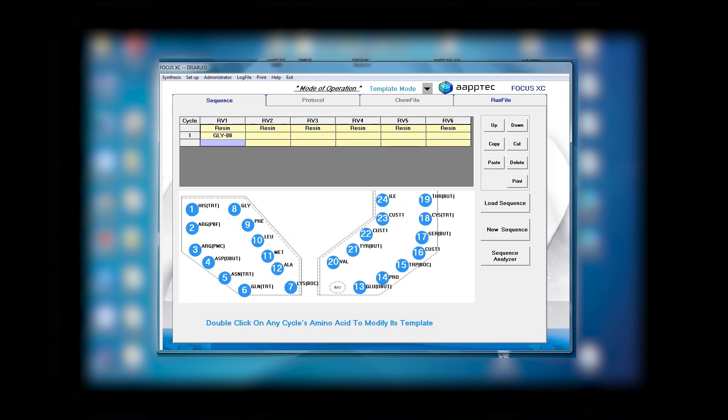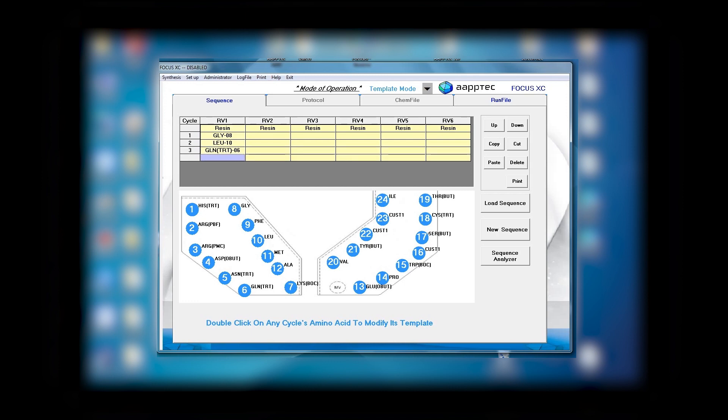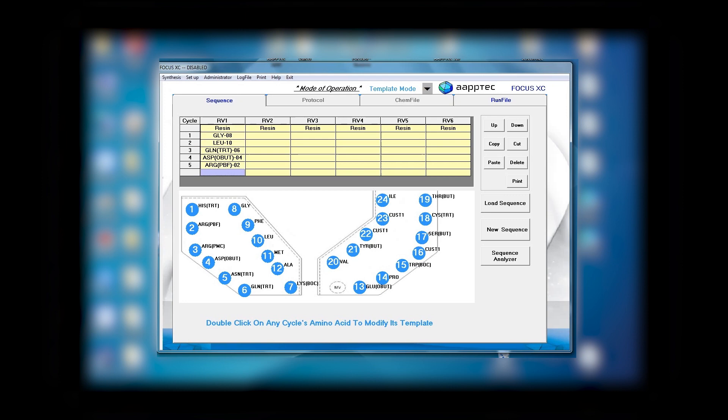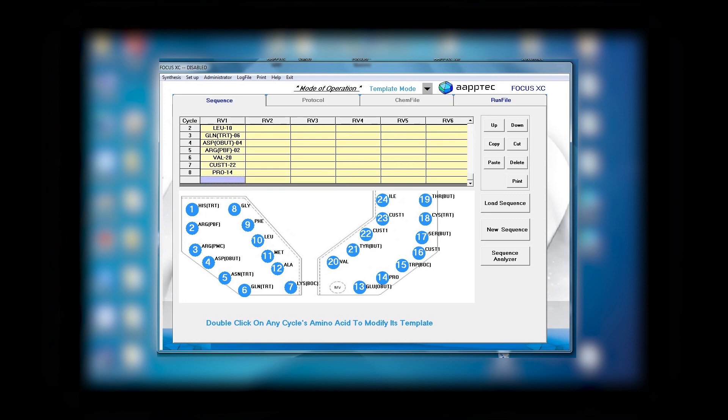The first thing I do is enter the sequence. For example, the first amino acid glycine, the second one is leucine, the third one is glutamine. I'll add aspartic acid and arginine, valine, tyrosine. You can select as many amino acids as you wish. In this example I'm selecting 10 amino acids.